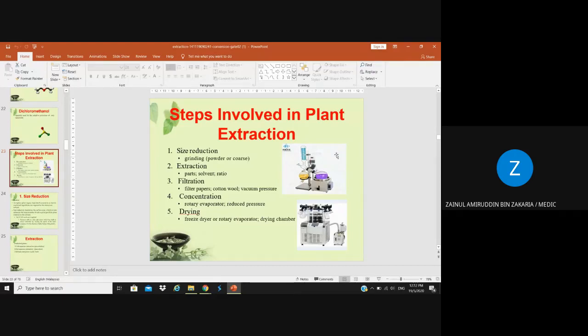While for the water-based extract left, the third one, what you need to do is put it in a minus 80 degree temperature. Then it becomes hard as ice. Then you put it in the bottle, and the water will be vaporized and sucked out by the machine, leaving only your dry water extract.